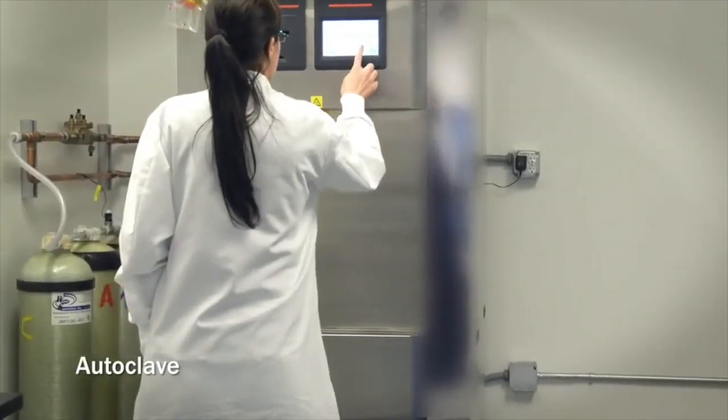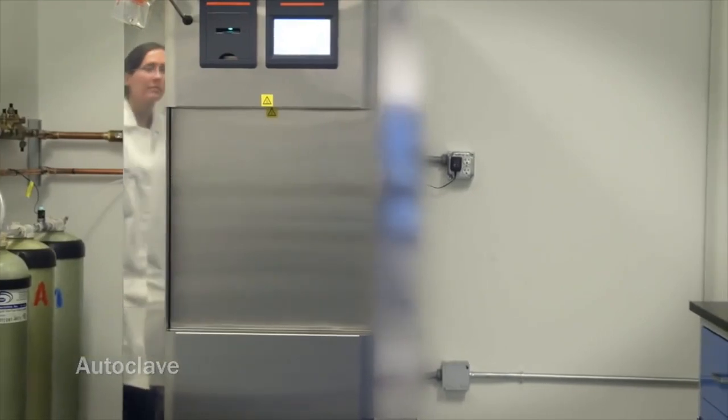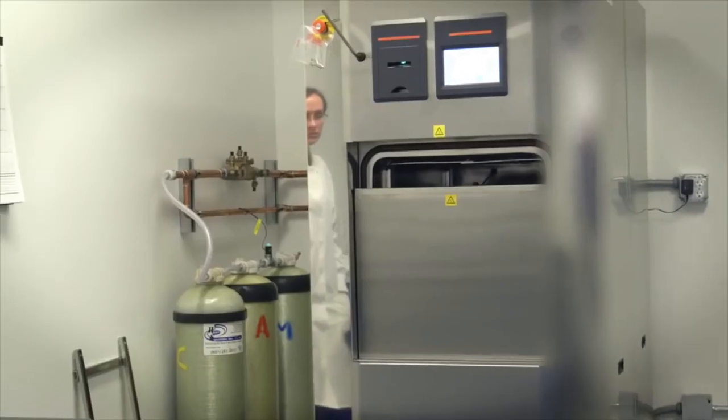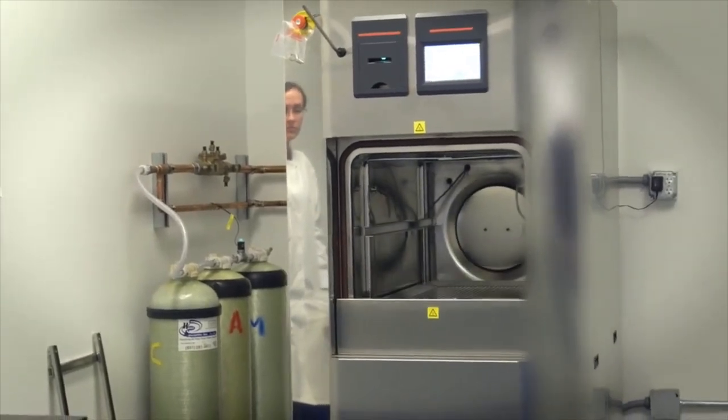The autoclave is a very important and unique instrument in every microbiology lab. It sterilizes the media used for testing microorganisms, as well as sterilized product that has been tested.